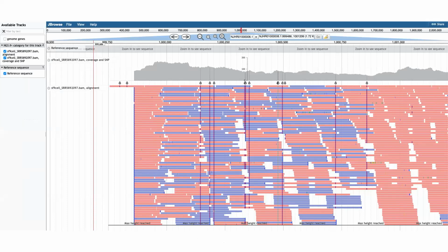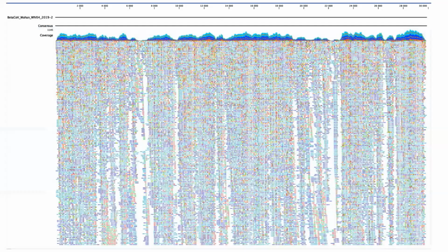In the case of viruses, it's the same story. We have here the sequencing with a lot of high coverage of reads for some genome. In this case, this is the COVID-19 genome, and you can see it has about 30,000 nucleotides. And the reads, the information that we actually first have access to, are the sequences of these short reads.